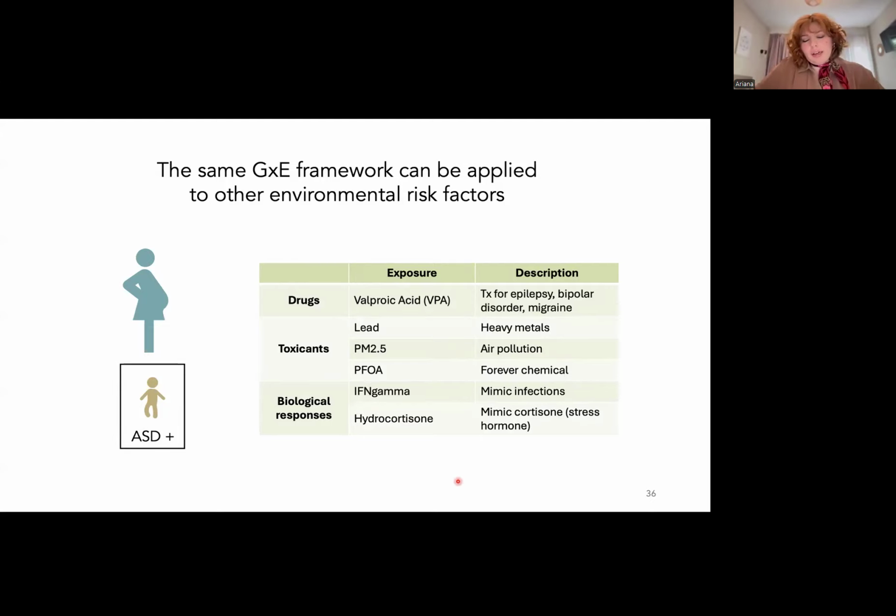This is known as that because it can be found in non-stick cookware or waterproof products, and also in water, in drinking water. And we can also model biological responses such as interferon gamma to mimic infections during pregnancy, or hydrocortisone to mimic stress.